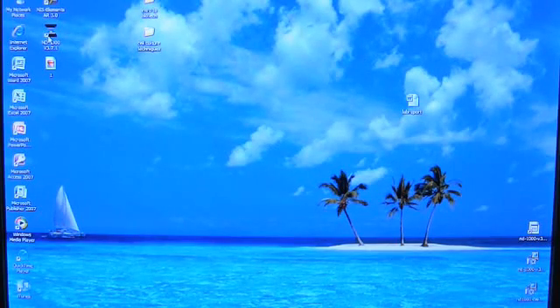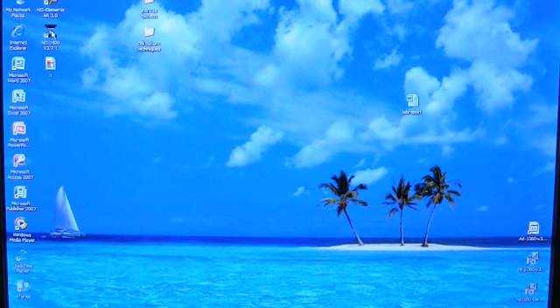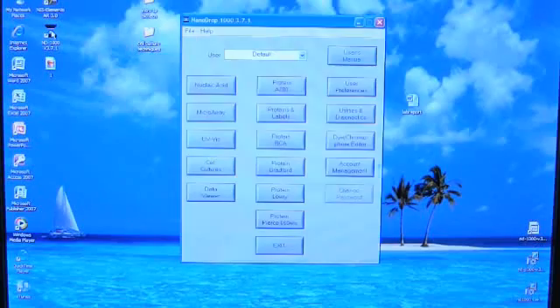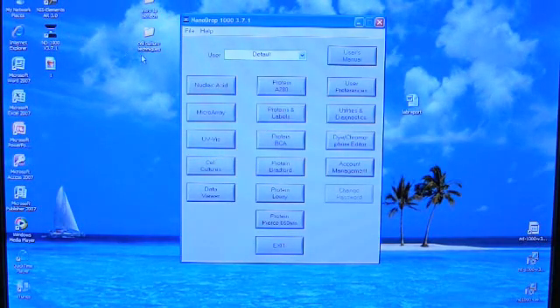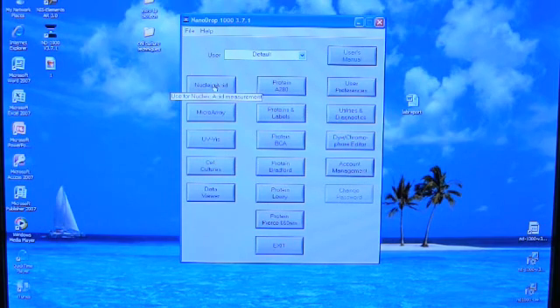Before beginning, boot up the Nanodrop software. First, find the icon labeled ND1000 and double click. Once the program starts, the software interface will be displayed. Since we are sampling DNA during this tutorial, find and click the button on the upper left of the menu labeled Nucleic Acids.